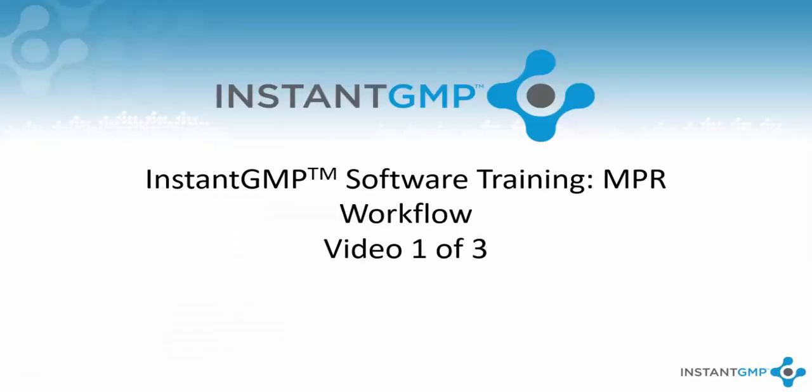With the completion of the project section of the software, we will end the video here. Next time we will go over the intricacies of creating an MPR within the Instant GMP software.